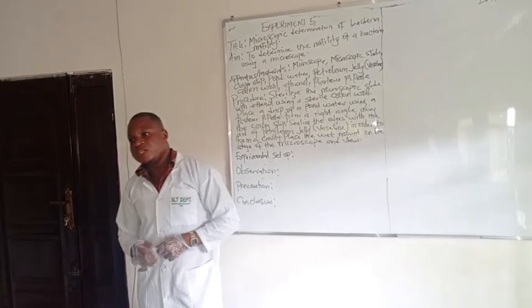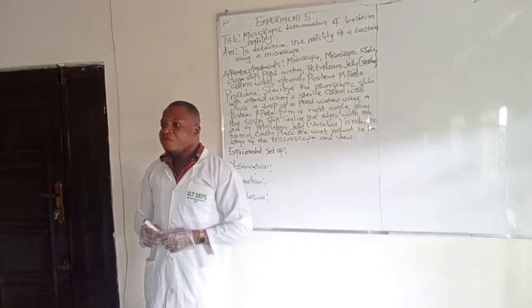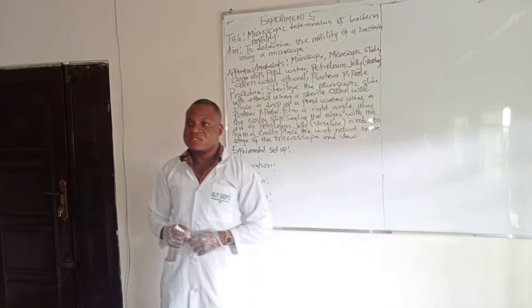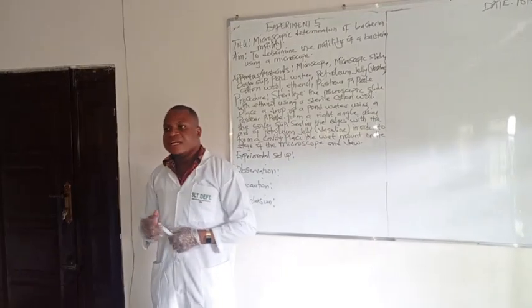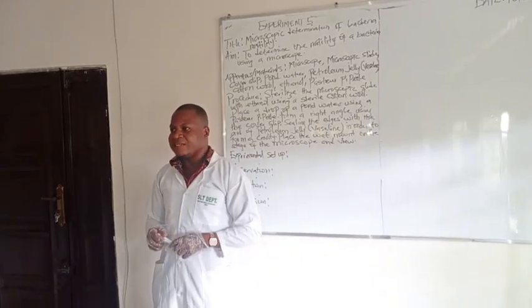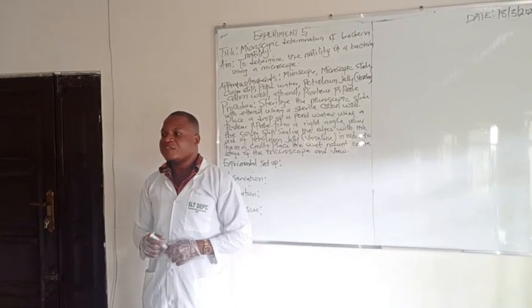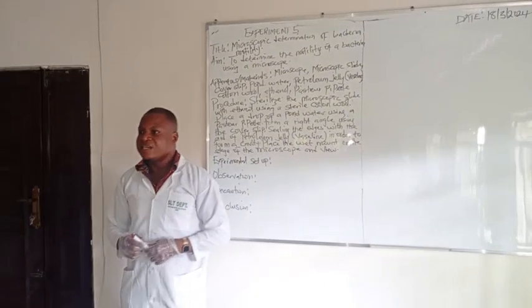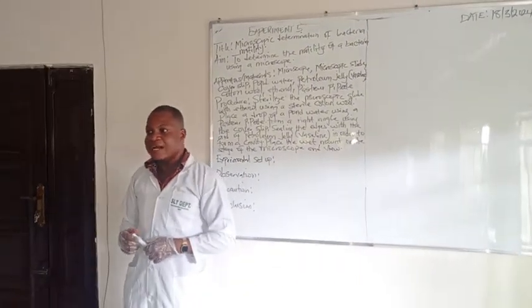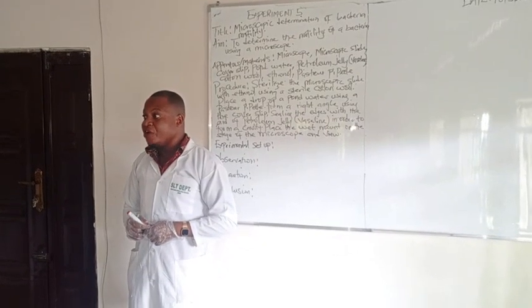When we talk about motility of the bacteria, we're talking about the ability of bacteria to move. Movement of bacteria using what? Energies, these are called metabolic energies. Bacteria have energies, just like human beings. They are also living things, because they are able to carry out some characteristics which living things carry out, talking about the plant and the animal groups. Are you following?